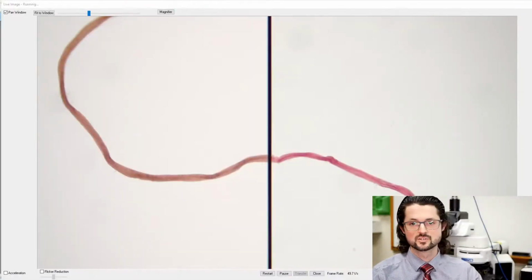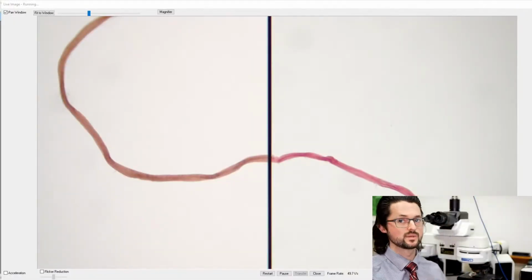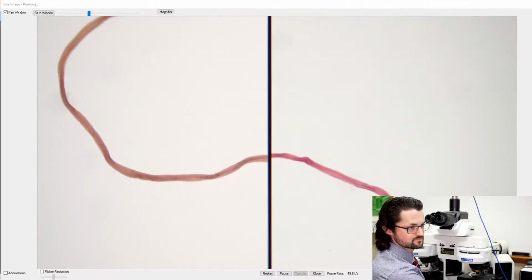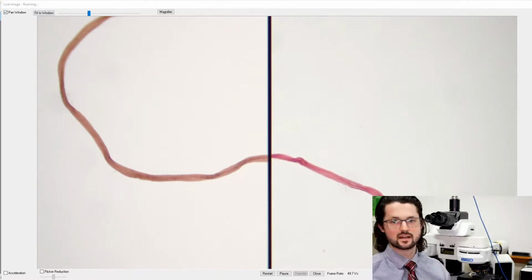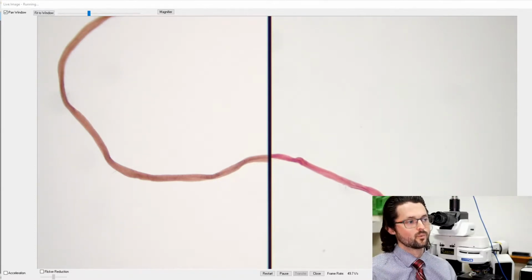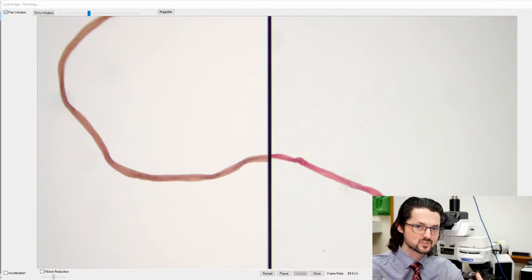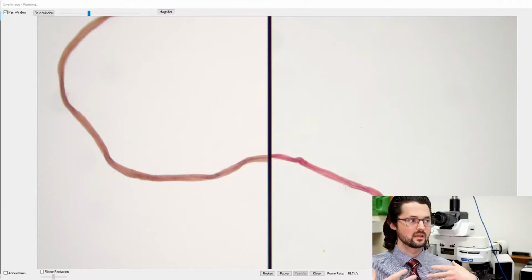Okay, so this is a view of the comparison scope behind me. I'm using one of our LED fiber optic light sources, and you know it's live because I can move the stage around, so you can see what we're working with. What's cool is this shows a couple things. You can see how even our backgrounds are, and I like this example a lot. These are two very similar red fibers, and this is where you really want that color rendering to be able to see those subtle differences between the two.